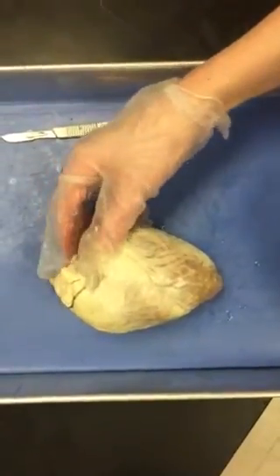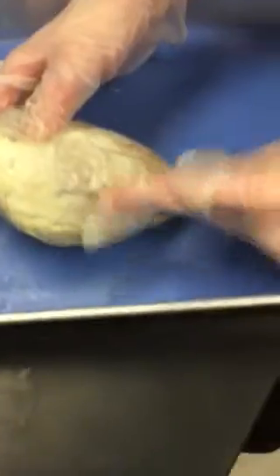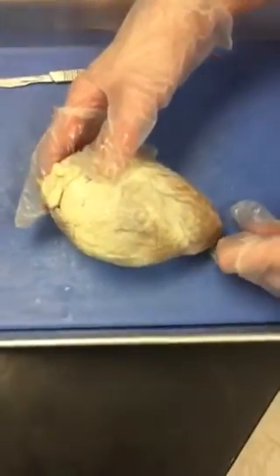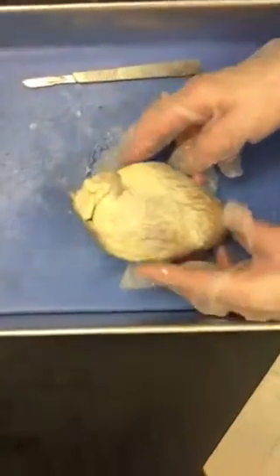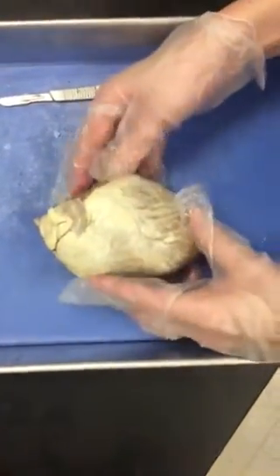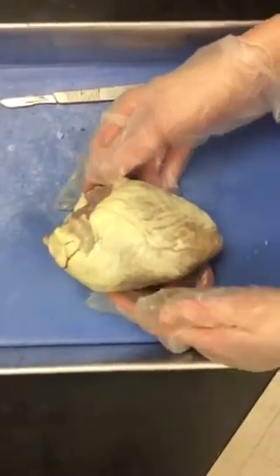12, note that to the left and above the apex is the right ventricle. 13, use your finger and push on its outside wall. Compare it to the left ventricle. Notice it compresses easier than the left ventricular wall. In the space below, differentiate between the functions of the left and right ventricles.